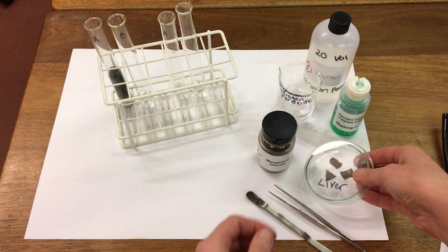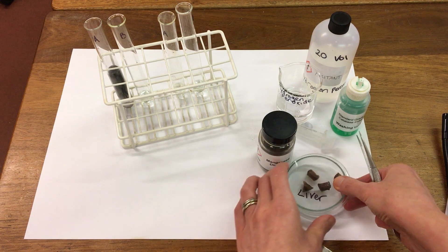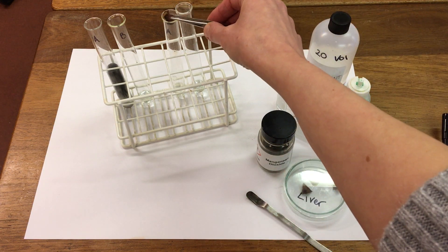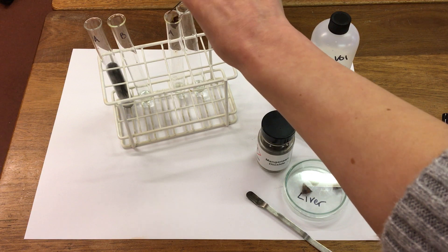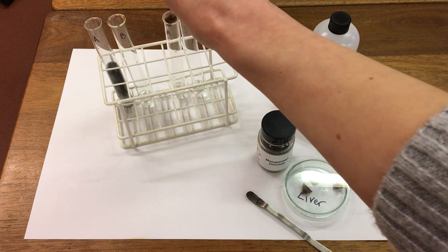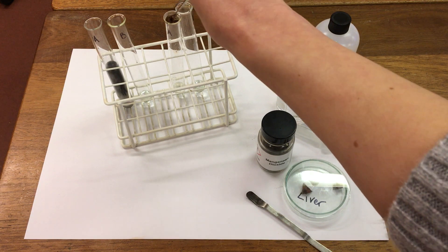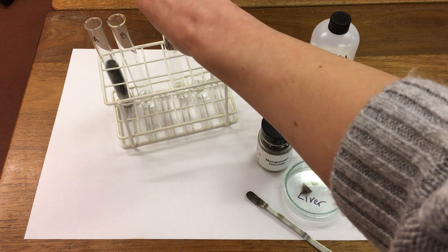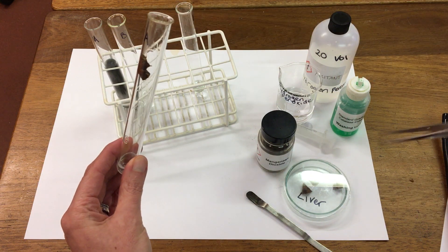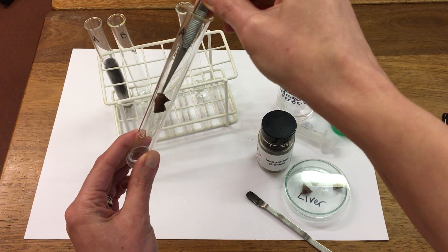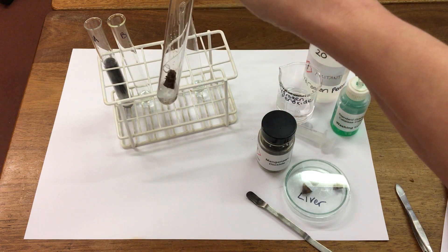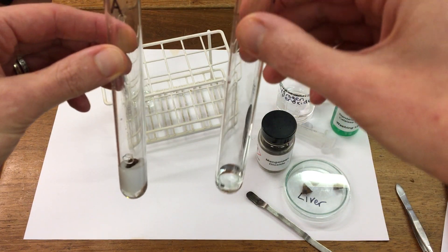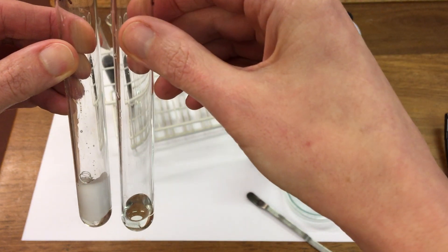Our next set we're going to use liver as our catalyst. So we'll take a piece of liver and pop it in and again compare it to a blank. This one's a little bit too big. There we go. So again we can see a foam being produced compared to the blank.